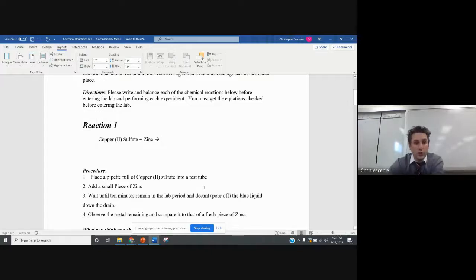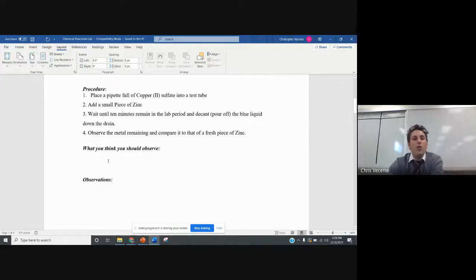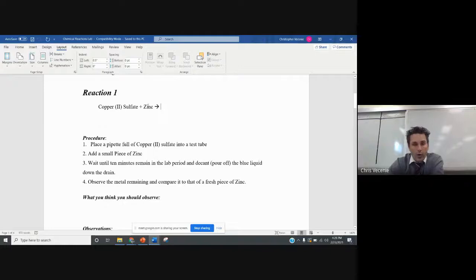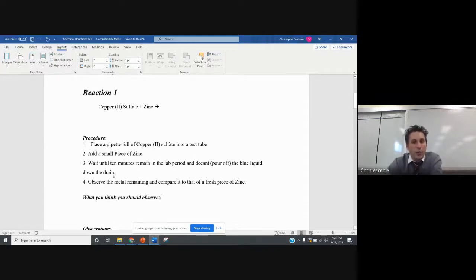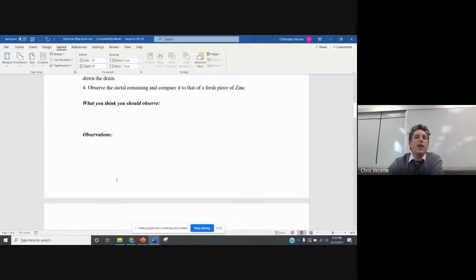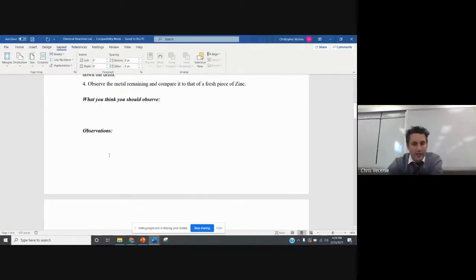What I want you to do is go through each of those. Then, based on what you know about substances, what do I know about zinc? What do I know about copper 2 sulfate? What do you think should happen? This is just your best guess. What do you think is going to happen when we mix them together? Then we're going to conduct the experiment and you'll make your observations based on what I'm going to show you in the back.